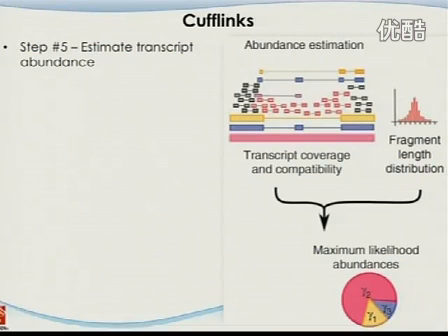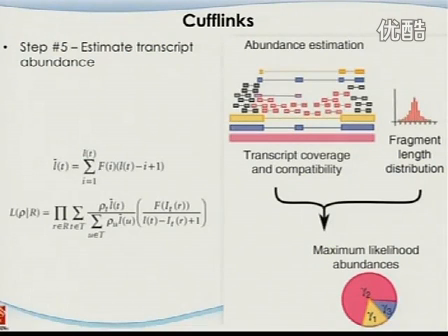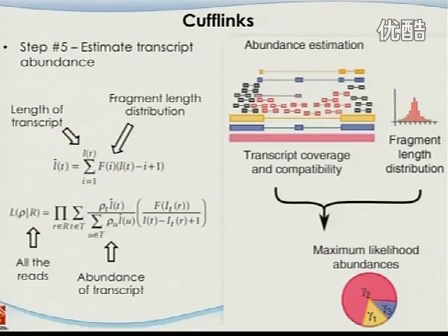black. Okay? So what you want to do at this stage is you map those individual reads to see which individual isoforms it's compatible with. And then together with the fragment length, when you do the RNA sequencing experiment, because you know both 2 ends, how long the middle RNA fragment is, there will be a range of that. And then running that through these equations, which I can tell you some of the parameters being used here.